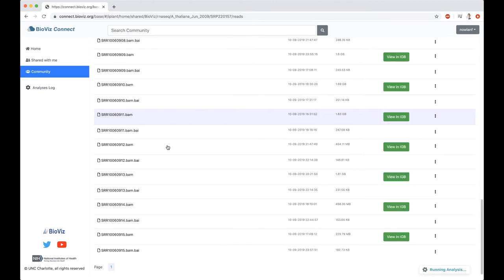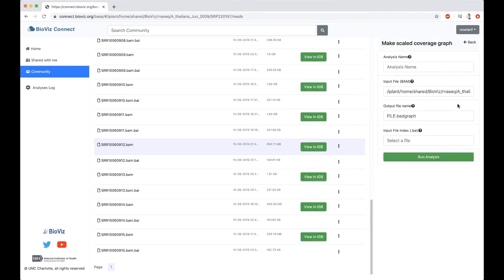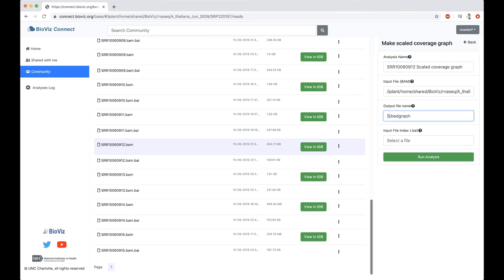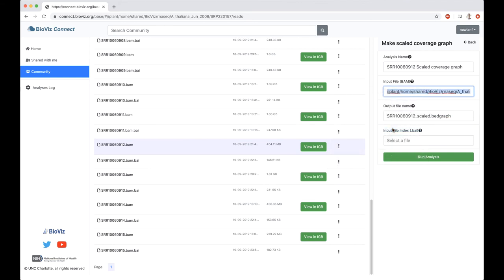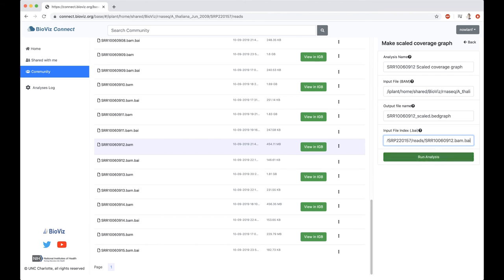I want to do the same thing for 912. Make Scaled Coverage Graph. It's SRR10060912 Scaled Coverage Graph. Go to the file. It's SRR10060912 Scaled. And then again, I'm going to copy the input file name. I'm going to paste that here. And then just add the .bai at the end for my index file. And hit Run Analysis.